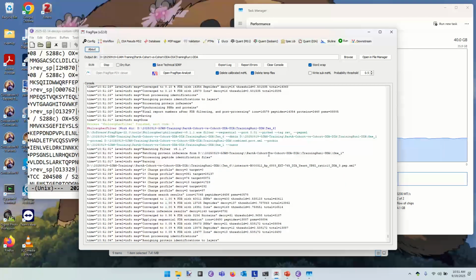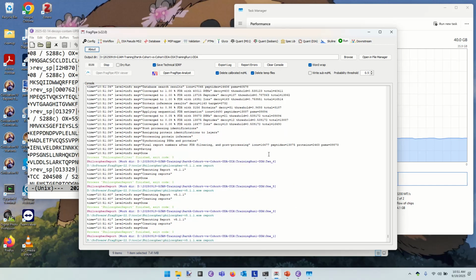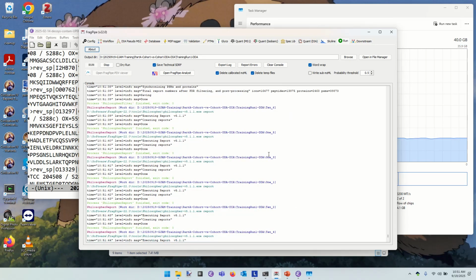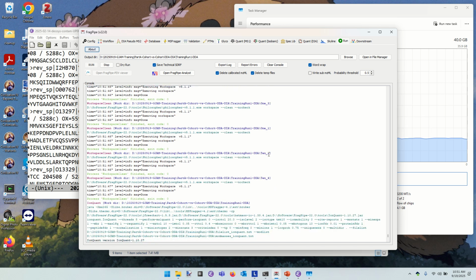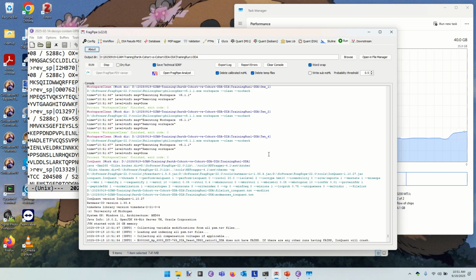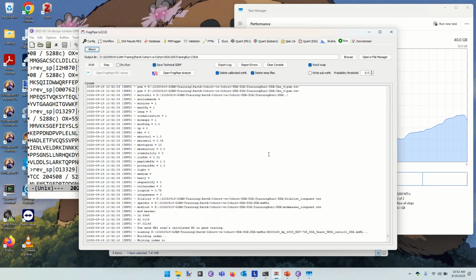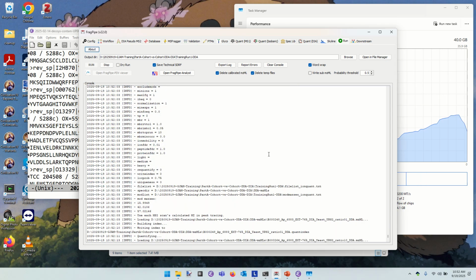But does it mean that you are expecting that all 6 samples should have the same identified proteins in different amounts? It is acceptable to invoke a protein because it has enough evidence in these 3 files, even if it's got no evidence whatsoever in the other 3 files. So it is not making the requirement that peptides be seen ubiquitously, or that the evidence is spread evenly across the data. But it does need to have one inference that explains that.